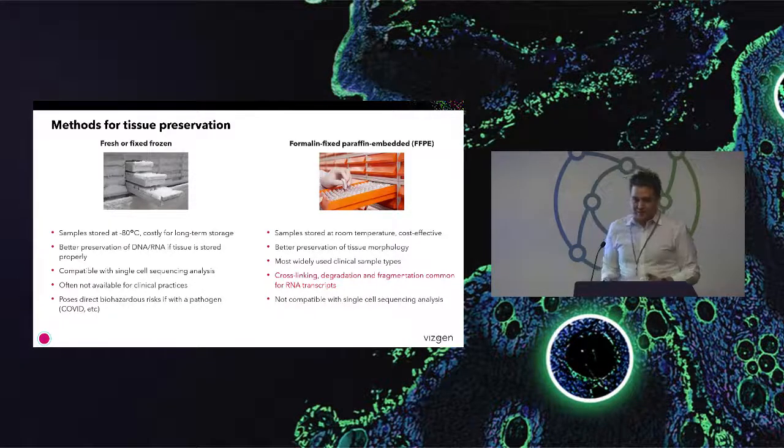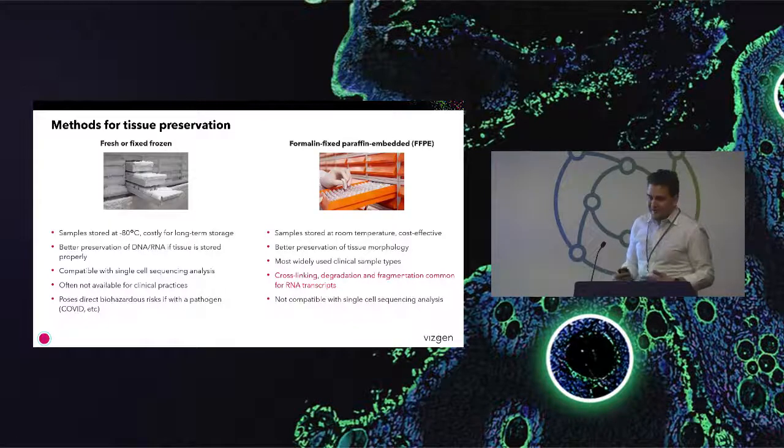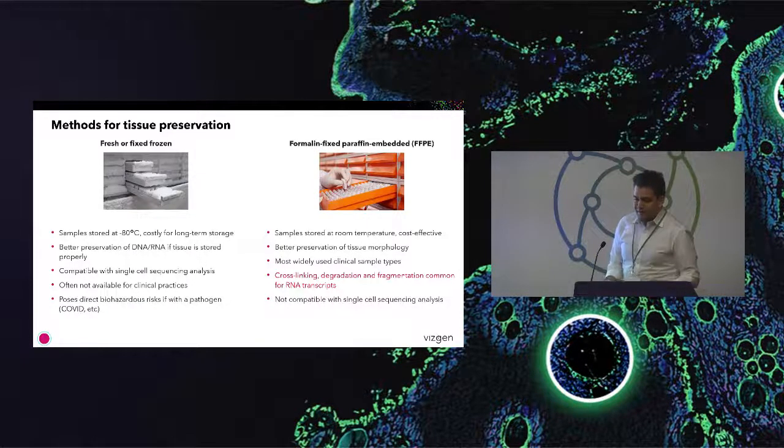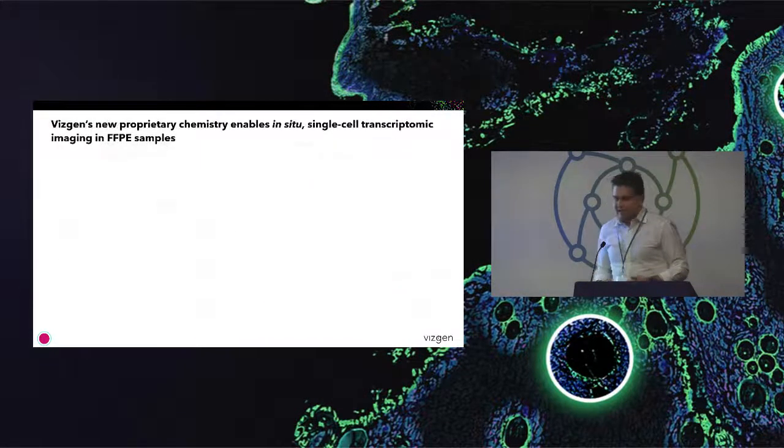On the other hand, FFPE tissue blocks have their own set of advantages. Since they're fixed early on, it helps preserve the tissue morphology. But at the same time, they're more prone to degradation, especially with the typical ways that they're stored at room temperature. So since it's an RNA measurement, it's really critical to have ways of measuring the RNA. So we've been working to optimize the protocol for some of these more fragmented or degraded samples. And that's what I'll be discussing over the course of the next few slides.